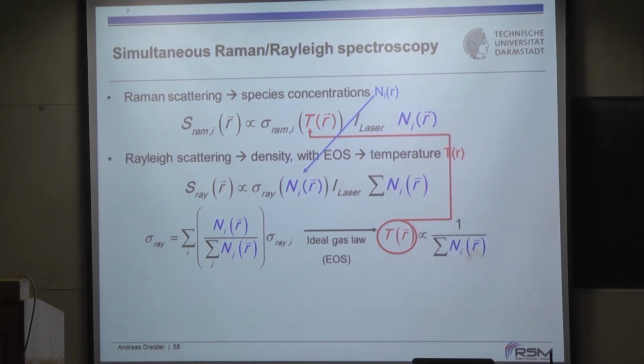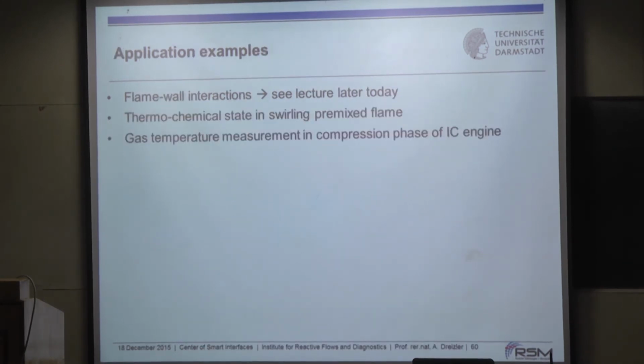So there, just as a side note, we use information from people from quantum chemistry, and there are single groups working, for example, only on water. Yeah, water vapor, understanding the cross-section of the Raman of the water molecule, and doing that for 30 years. And so that is the kind of information we need and we rely on, and we just exploit it for these purposes. Well, let's have now some examples to make this more interesting.